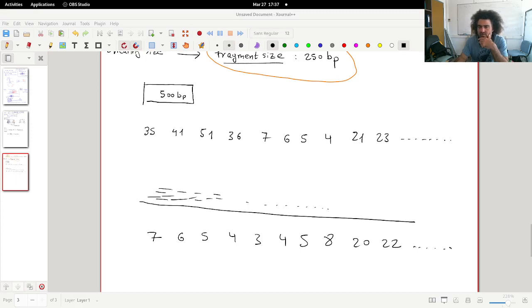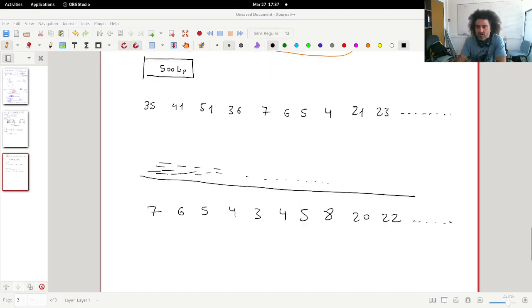Now let's see what is the process to find significant windows. In the previous video we had the term interesting windows, and now we will do a statistical analysis on that to find significant windows.